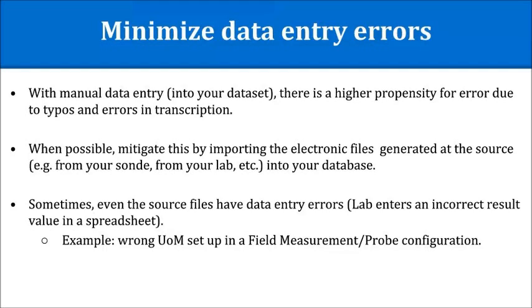Some people have continuous data loggers, for example, or sondes that store their data, and being able to take the data straight from there into WQX, as in we work with those formats that you're getting out of your loggers, and we can map them using the import configurations to get them into WQX, and then we limit your data entry errors.